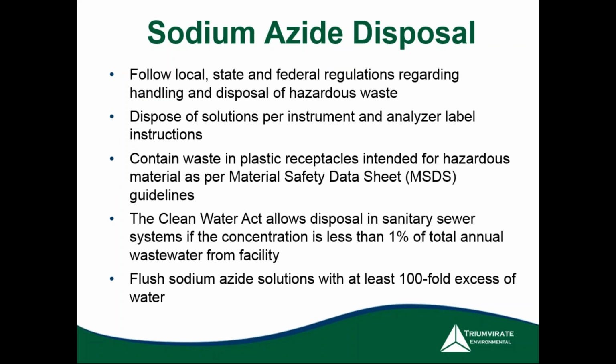Sodium azide disposal. Obviously follow local, state, and federal regulations regarding handling and disposal of hazardous waste, including potentially explosive materials that have accumulated or concentrated sodium or metal azides. Just keep that in mind about materials and building materials around the lab. Dispose of solutions per instrument and analyzer label instructions. Keep in mind what I discussed earlier, that the implications of your laboratory waste piping or improper flushing can result in a hazard, even by following those manufacturer instructions.